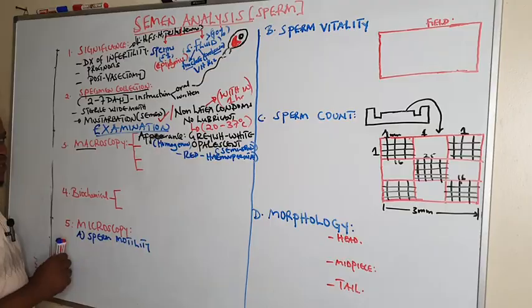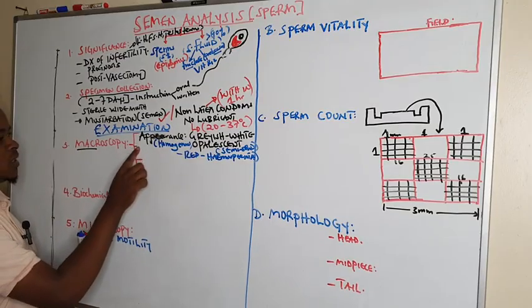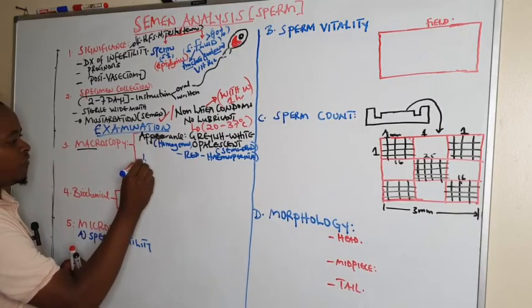Then another thing after appearance that we can talk about is the liquefaction time.